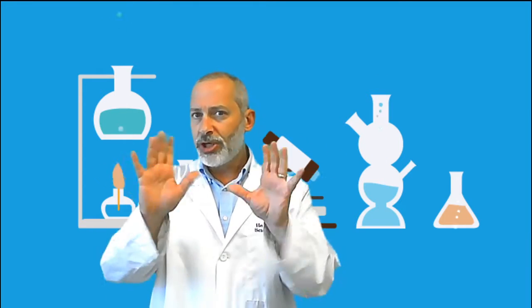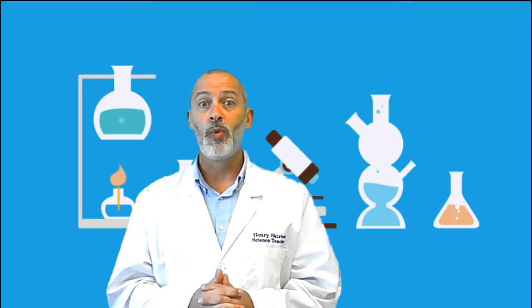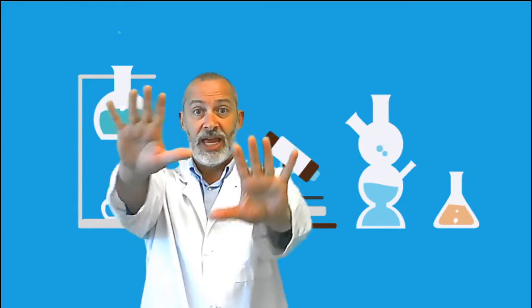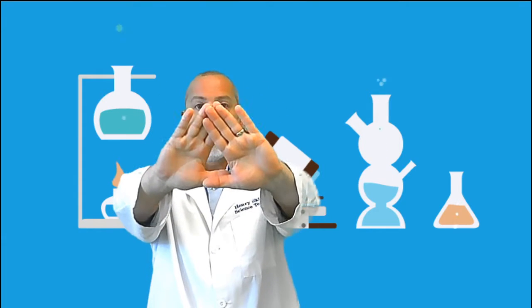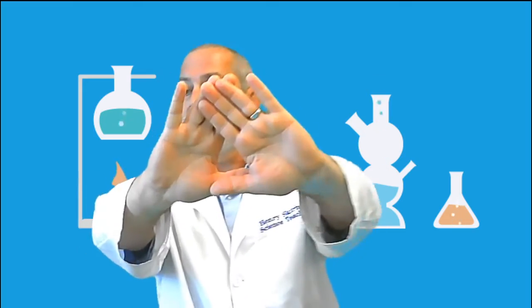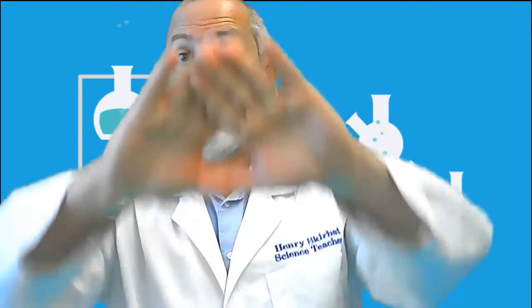But regardless of your experience or knowledge of dominant eye, here's what I'd like everyone to do. Are you ready? Little activity. You're going to take both of your hands and put them an arm's length away from you. You're going to take your hands and form a triangle with your two hands. See how your thumbs are together? Your thumbs are together and your fingers are together, and you're creating a triangle here. Illuminati. Don't do that. Okay.